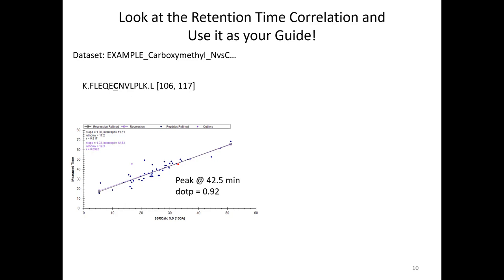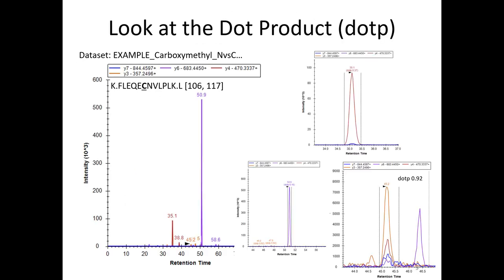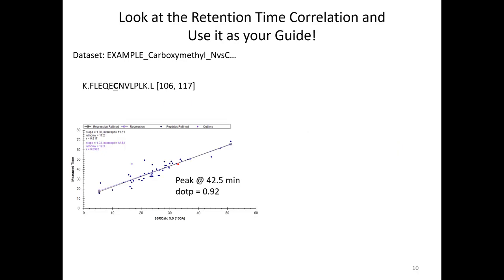But the other thing, let's go back for a second, on this one the dot products are shown. So here, the big one is 0.16. That's a terrible score. This one is 0.37. That's just slightly less terrible. And then this one was 0.92, which is much better, closer to 1. So looking at the dot product helps in this case.